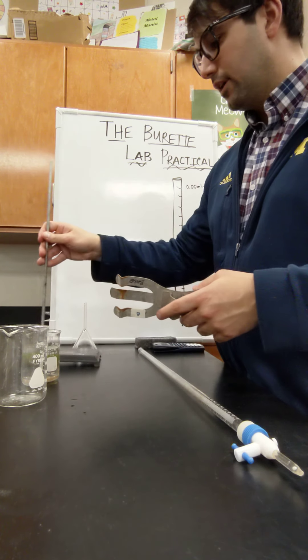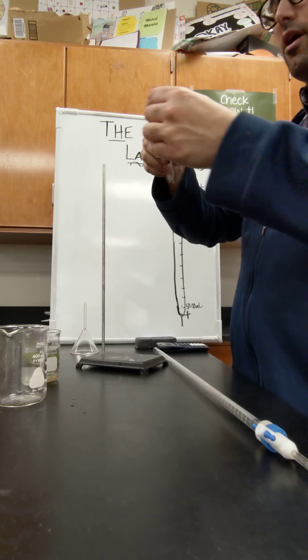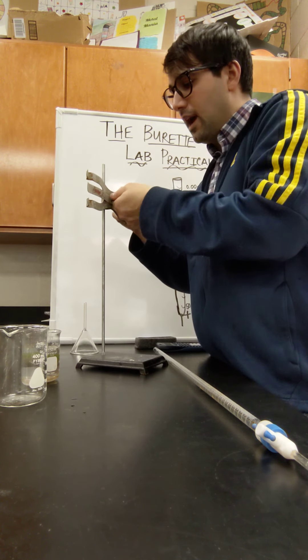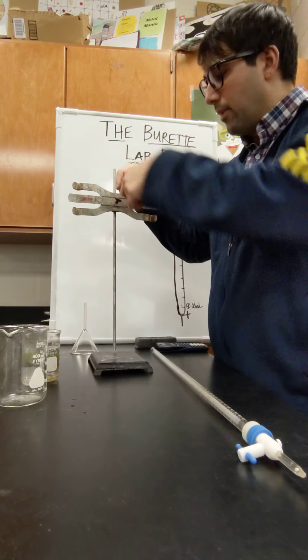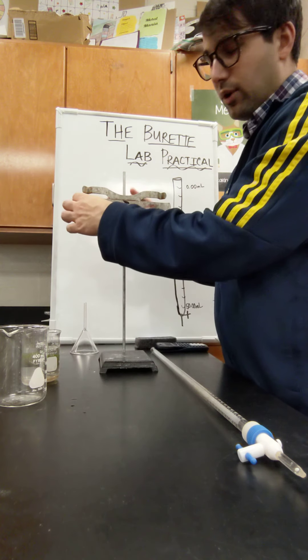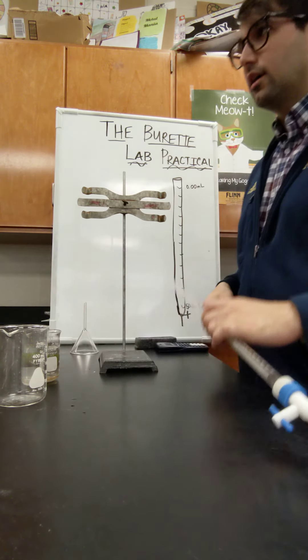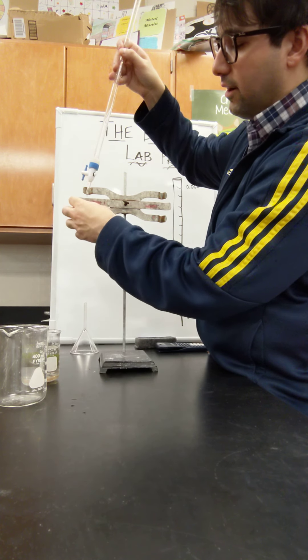One of the first things you're going to do — and you can do this as you're watching me — is clamp your burette stand to the ring stand. This is known as a burette clamp. I'm putting it on and clamping it up at the top. I can twist it and it tightens onto the ring stand. The middle metal part of the burette clamp can open up, and that's where you're going to put your burette — straight through the middle part and down through the top and bottom.